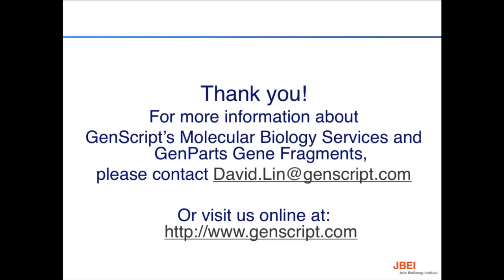Yeah, that's a good question. There's a variety of different ways of doing that, and there are different trade-offs. You might be able to do very simple old school ways, just using salt concentrations and glycerol or PEG and centrifugation types of ways of separating away maybe the contaminating oligos from your PCR products. You could just use simple PCR reaction cleanup columns, which can be great if you have very pure PCR reactions without any contaminating bands.